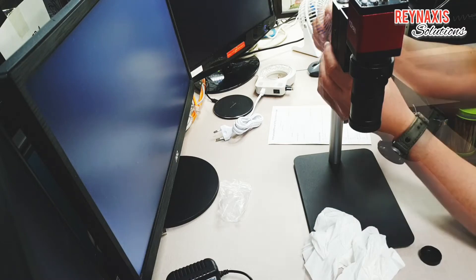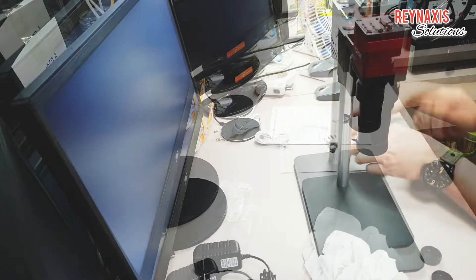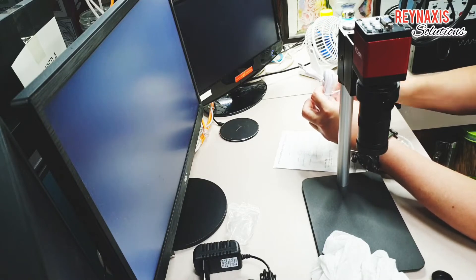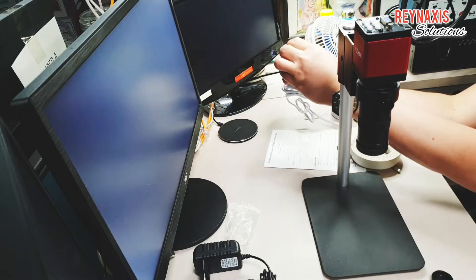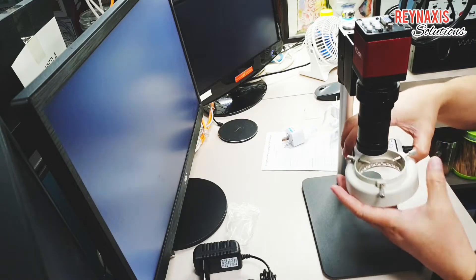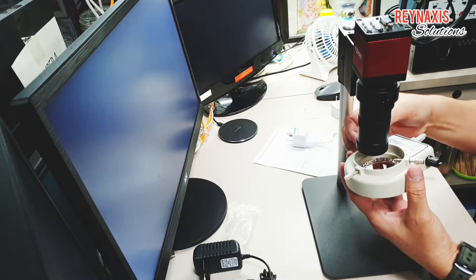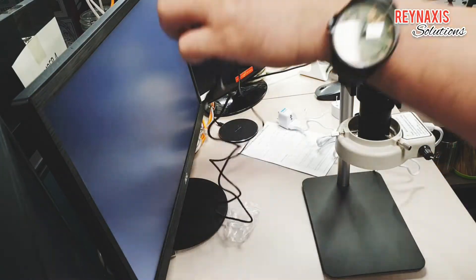The ring is also secured with the proprietary screwdriver. There you go — it's almost completely assembled. I'm going to attach the LED lights now. It is only using two pins, but I have attached a three-pin adapter so I can use this in Papua New Guinea, where the standard pin connectors are three-pin.